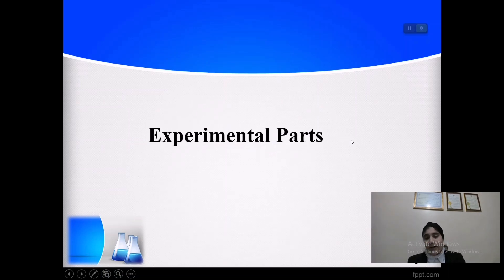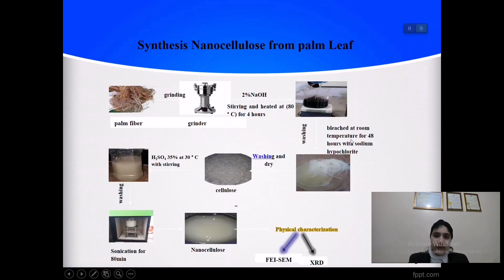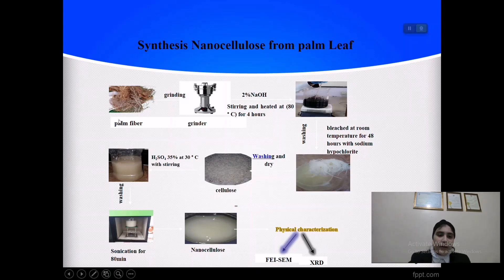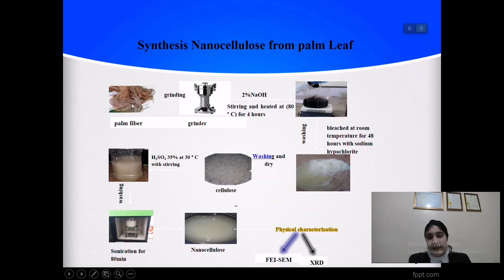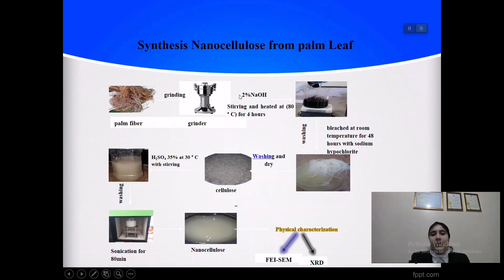Now we get to the experimental part. I used palm fiber. First, we collect palm leaves from any tree, then wash and dry them. After that, we grind them using a grinder.